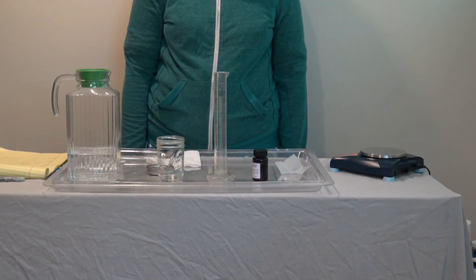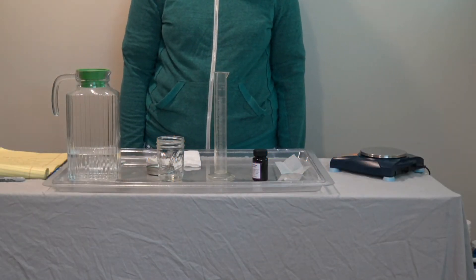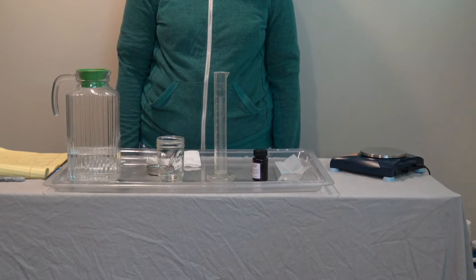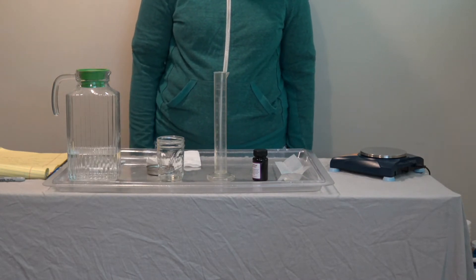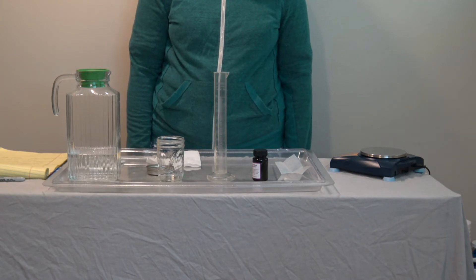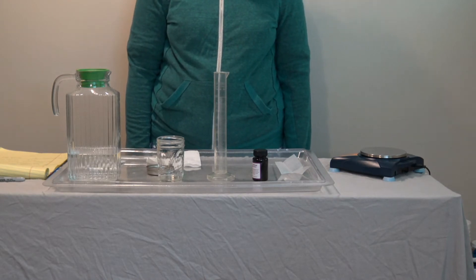In this lesson, Group F will be using a cabbage juice indicator solution as part of their chemical process. For one class, you will need to prepare 100 milliliters of cabbage juice solution.